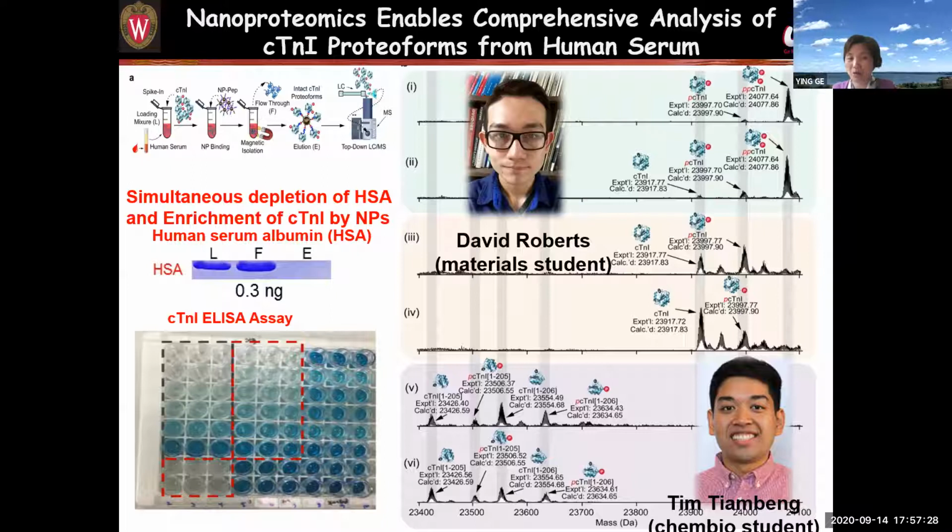But definitely we're hoping to work with pharmaceutical companies, because interestingly, a lot of pharma are interested in the troponin assay. Before drugs can be approved by the FDA, they have to be tested for cardiotoxicity, right? And the troponin assay is used to assess whether a drug has a toxic cardiac effect. Many very potent drugs cannot pass because of the troponin elevation in the ELISA assay.